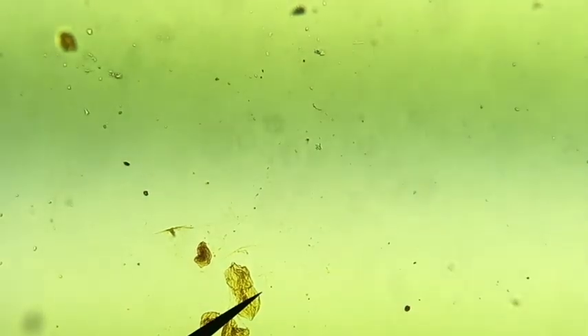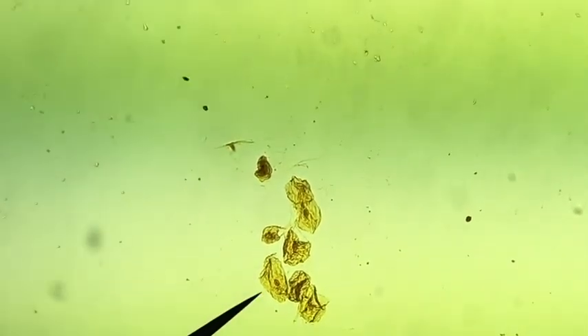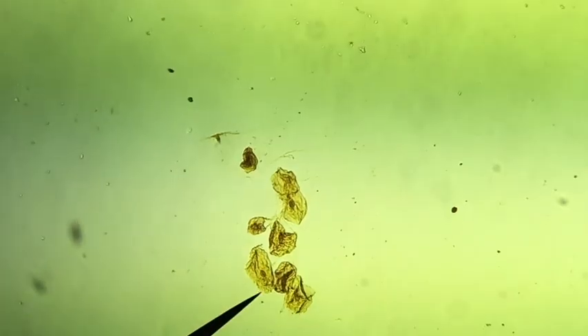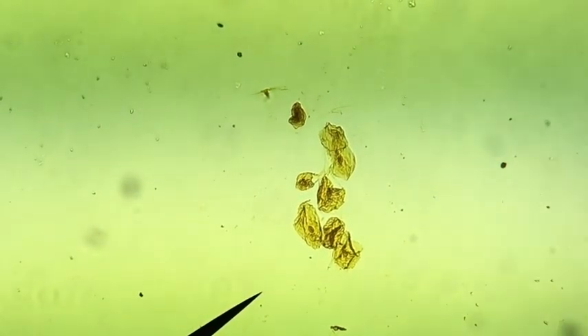I'll move it just a little bit so you can see it easier. There's a good one that hasn't been broken — it's got its nucleus visible. Here's another one that hasn't been broken with the nucleus visible. They're definitely a different shape than the plant cells. I'm going to try that under high power.